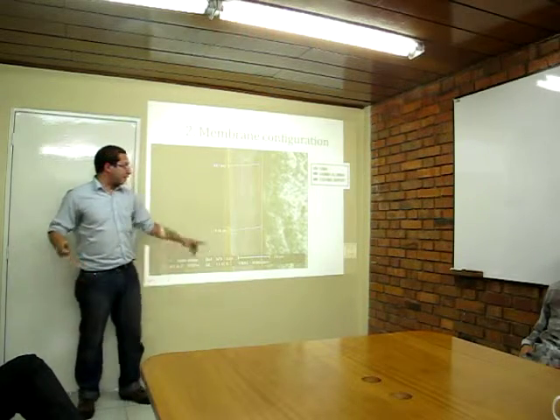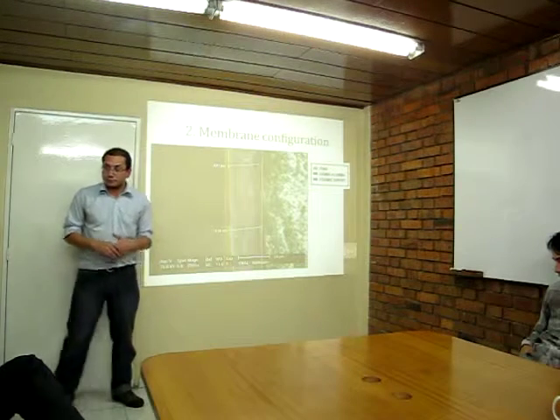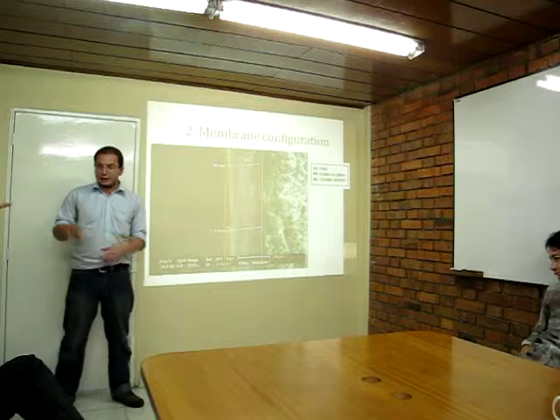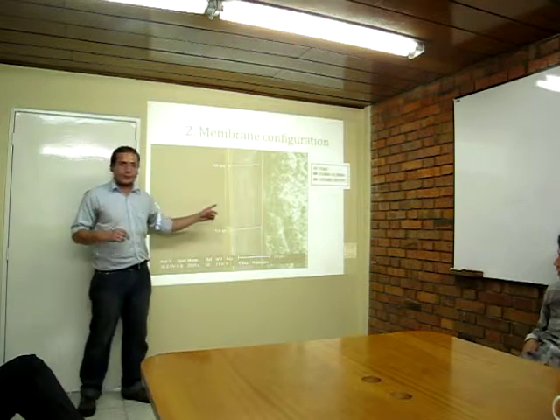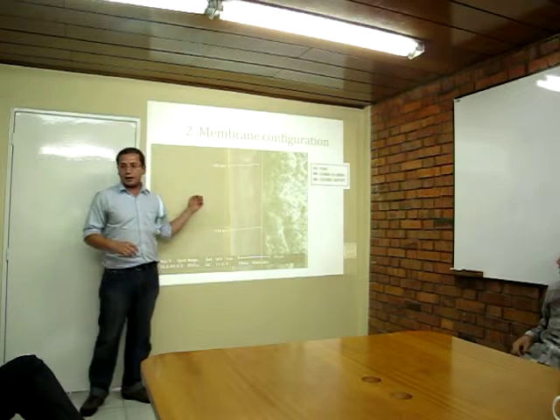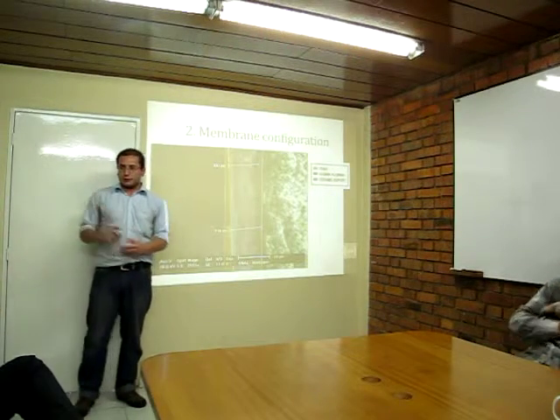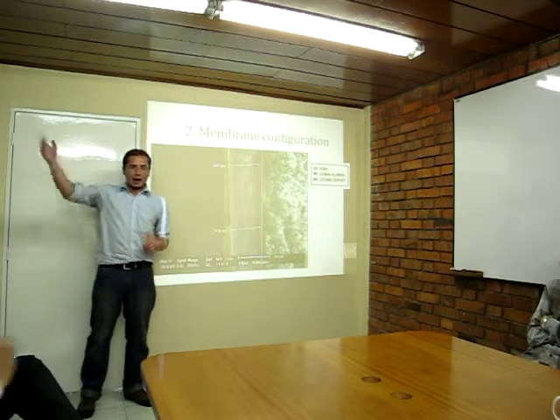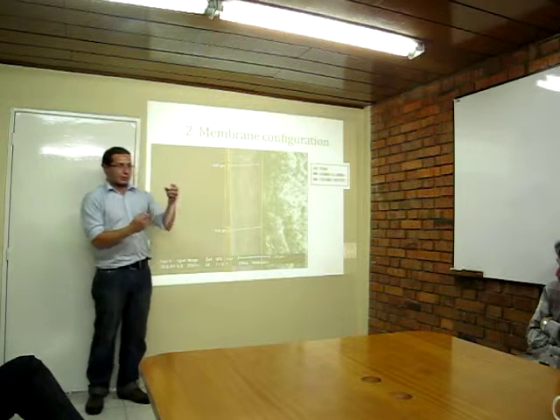For the gamma alumina layer, you need to prepare the suspension. Is it a mixture for both the gamma alumina layer and the PDMS? No. First you take the ceramic support. You buy the ceramic support from a company, and you take the ceramic support.